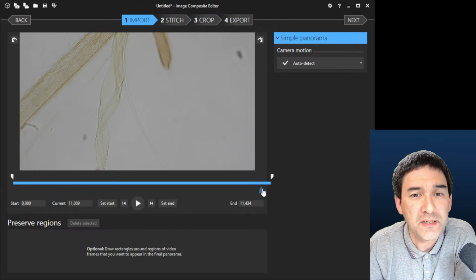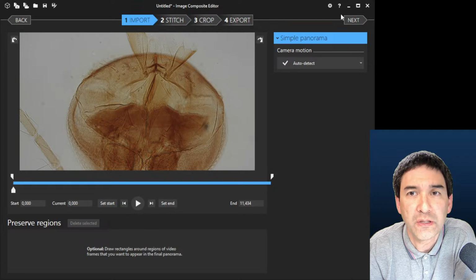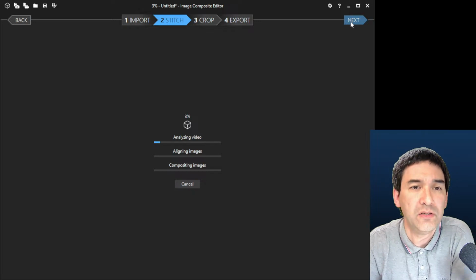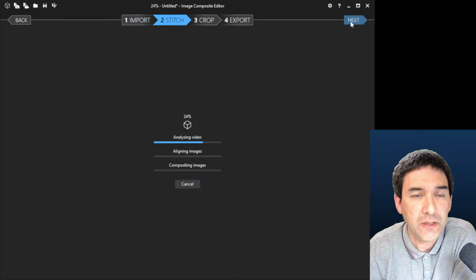So this is basically the video, and I would like to make an image of this. And I click here at the top. Okay, the next one, or you can also click the next button here on the corner. So just click next, and then you have to wait a little bit, and you now see that the software is analyzing the video, and then it's aligning the images and it's putting an image together.